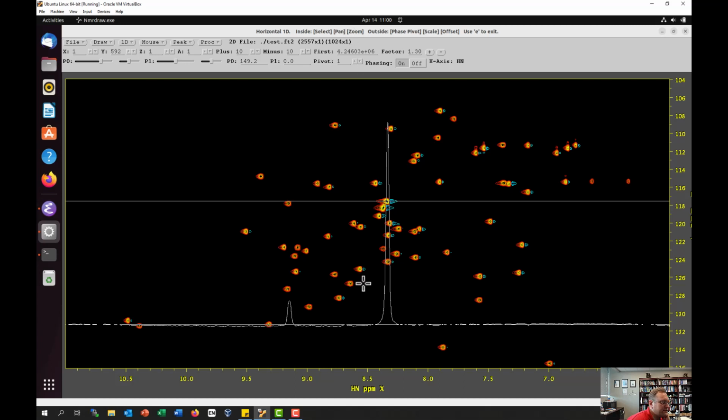But I could also zoom in on a peak, and so if I right click and zoom in, you can see I'm zooming in horizontally. Once I've zoomed in a little bit, I can press the middle mouse button and pan left and right, although again it's not doing a ton because this is a pretty broad zoom range.